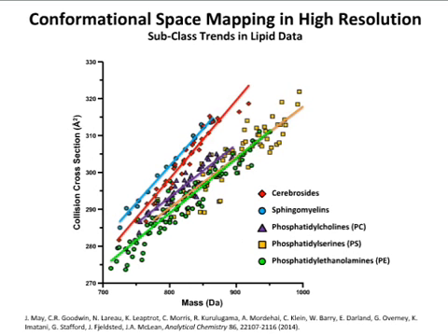Now, if you zoom in on one of these correlations, for example, just for lipids, what we find is that these different lipids fall into what we call fine structure. And that is, we can discern even additional details about what type of lipid it is. So, for example, these different color codings represent different classes or families of lipids.